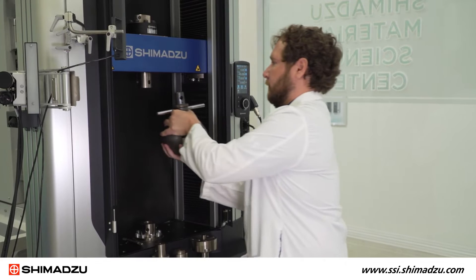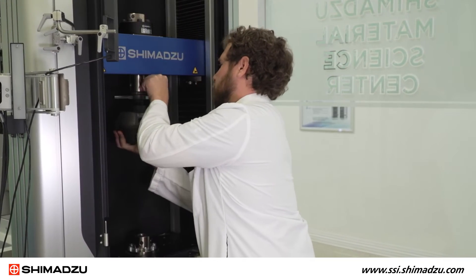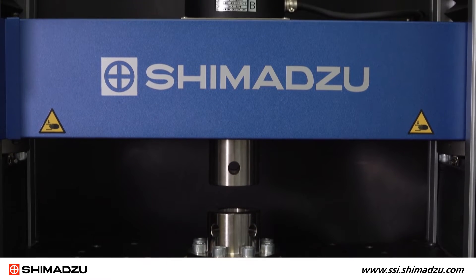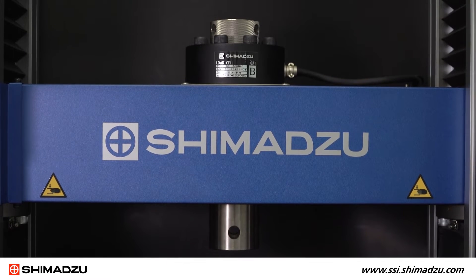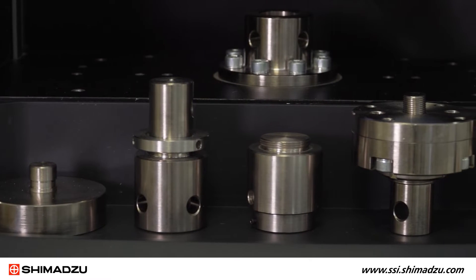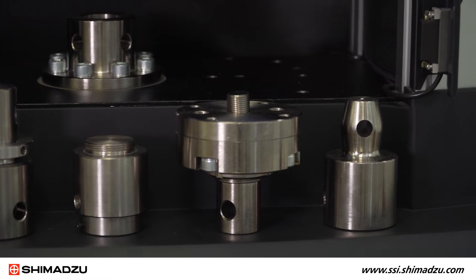The multi-joint provides a standardized way to mount a variety of jigs to the instrument. It enables the user to switch between different testing modes without replacing the heavier portion of the upper joint. This includes swapping between tensile testing with either fixed or universal joints, compression testing, or testing at lower capacities.